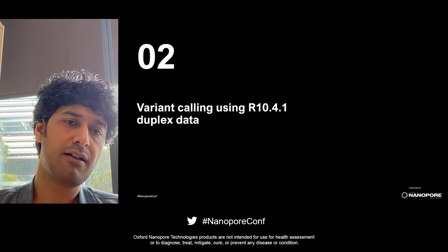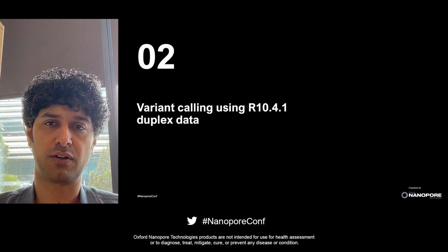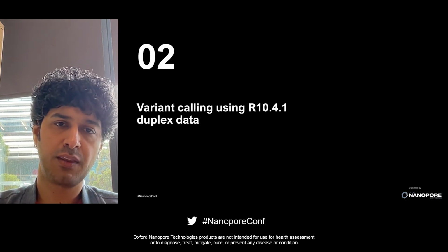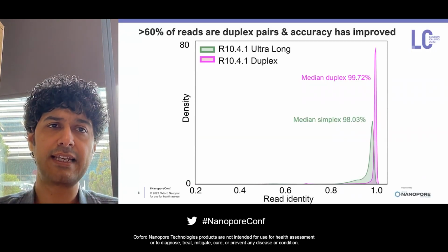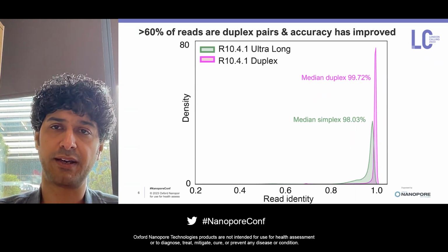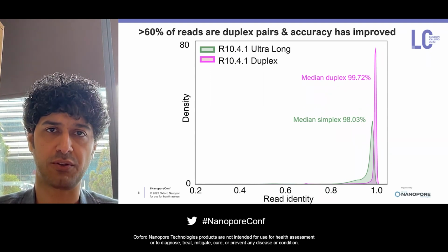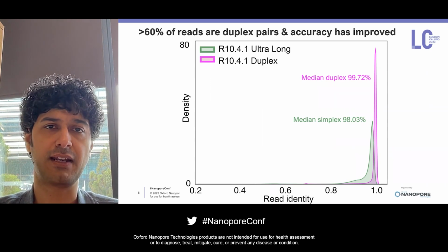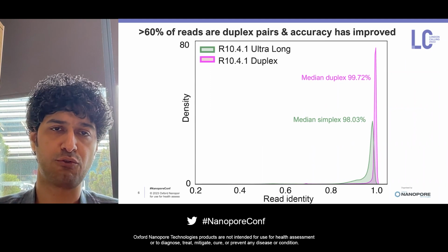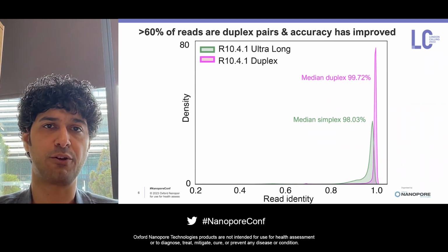In addition to this, we've also been working with duplex DNA sequencing chemistry, also for a number of months now, and that has improved quite a bit too. More recently, we consistently get over 60% of the reads that we achieve from a PromethION experiment as duplex pairs, which is impressive. And that means half of those, so 30% of the experiment, is typically on the order of duplex data. We anticipate that this number will improve as the London Calling conference proceeds and we see an update from the Oxford Nanopore team.